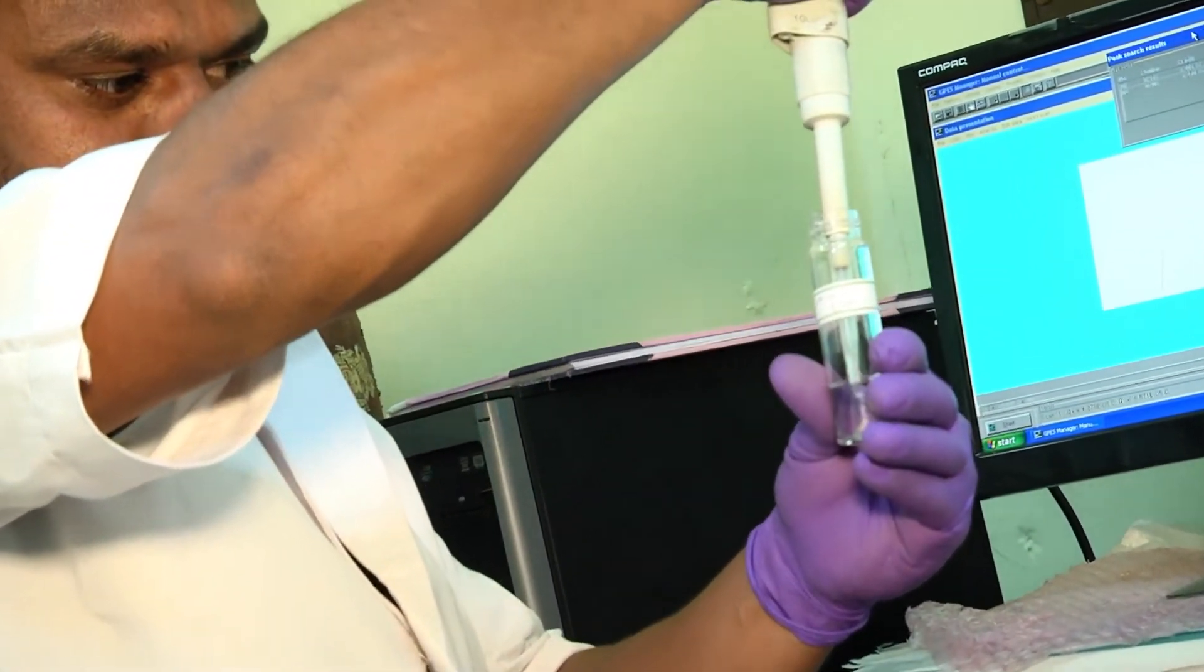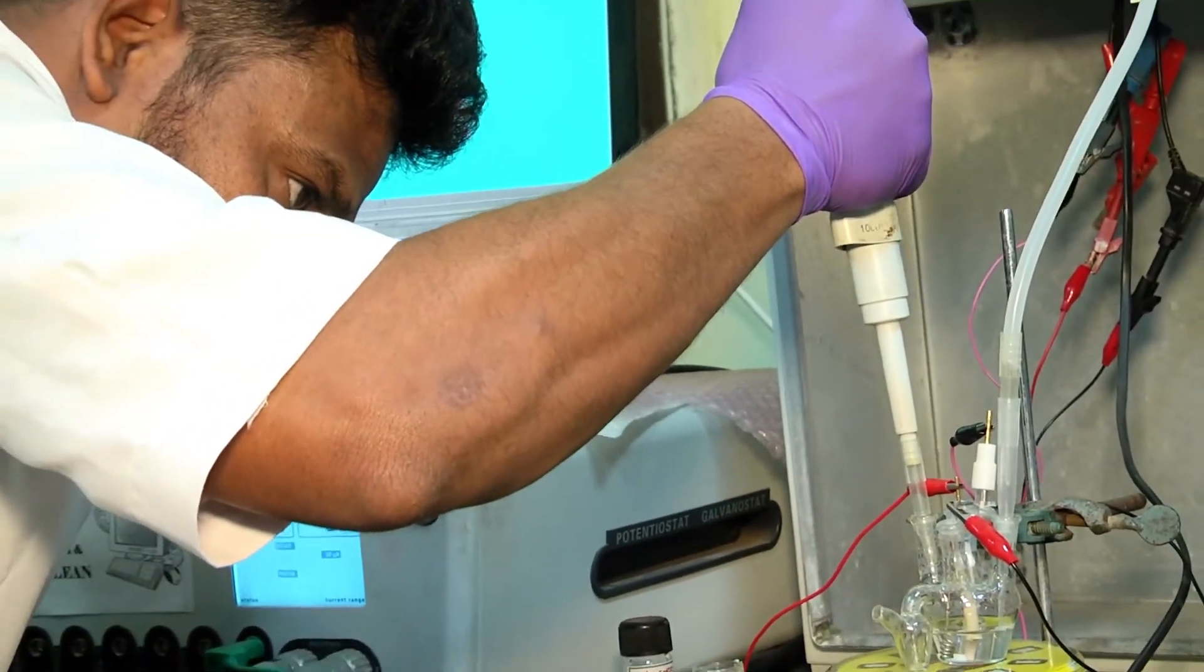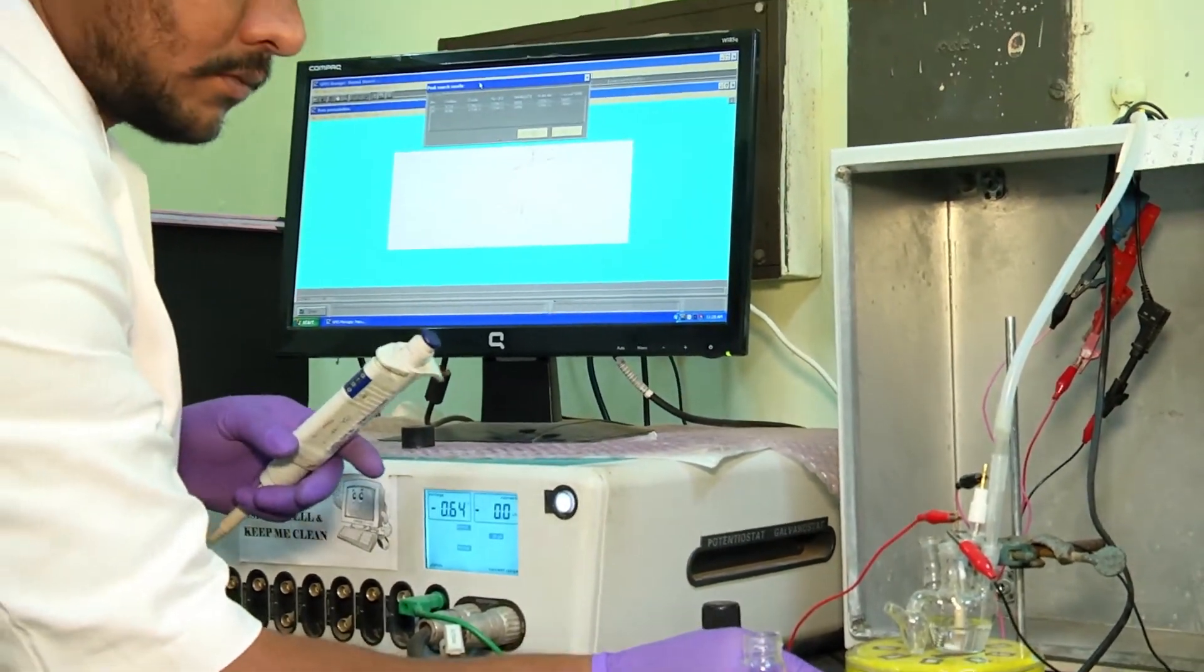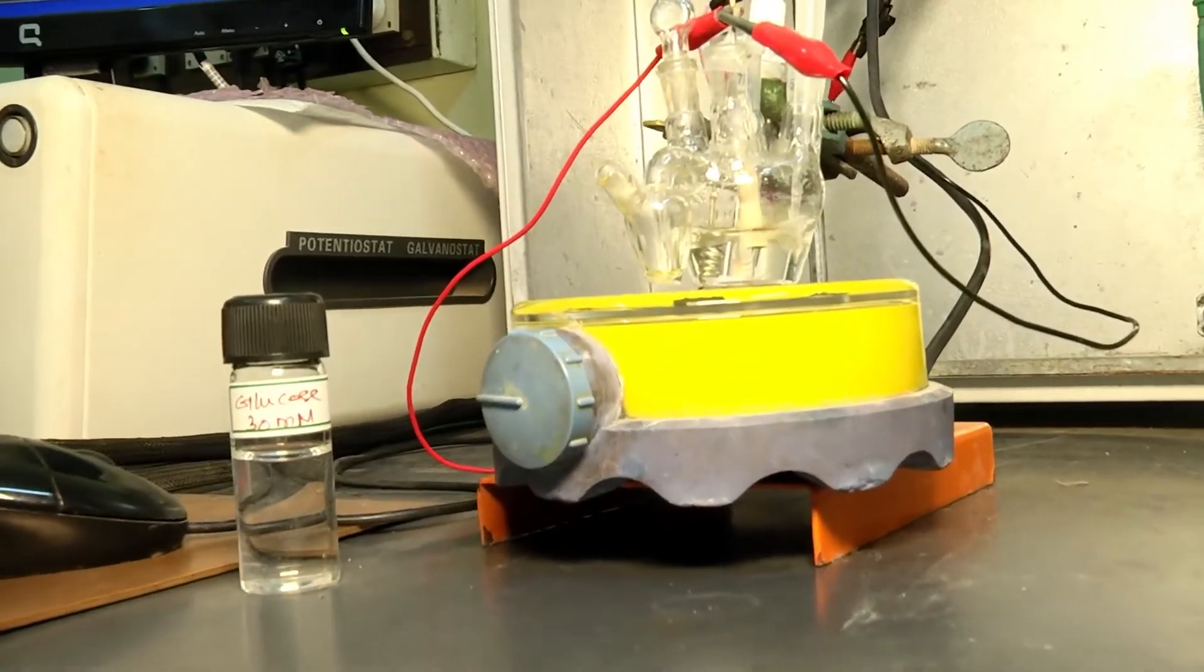Then for demonstrating glucose sensor, a known quantity of glucose is added to the electrolyte from the stock solution and left to stand for a few minutes.